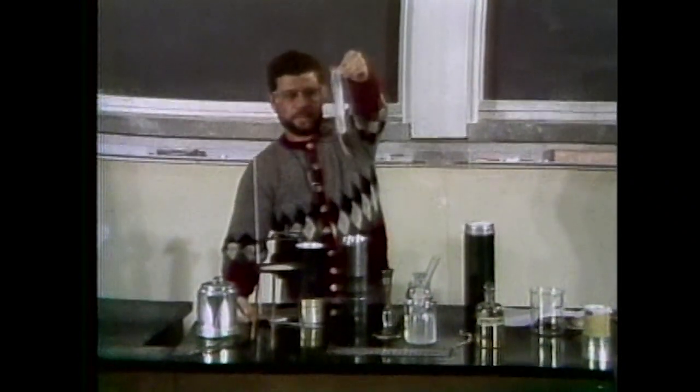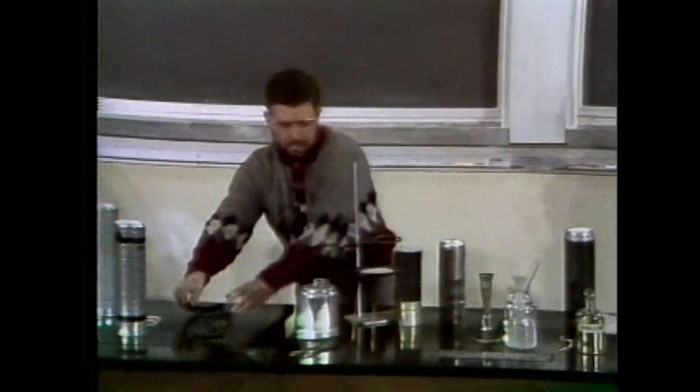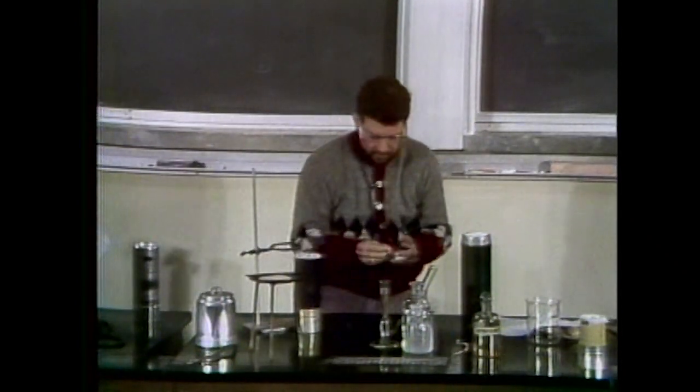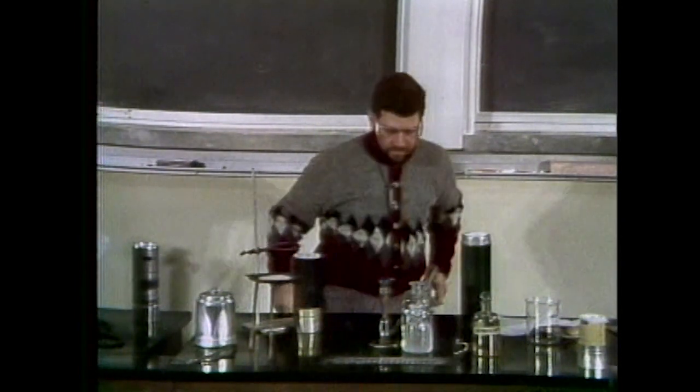You see, we have some liquid methane down there. I guess I'm not quite ready to get it out yet. So what I'll do is light the burner.